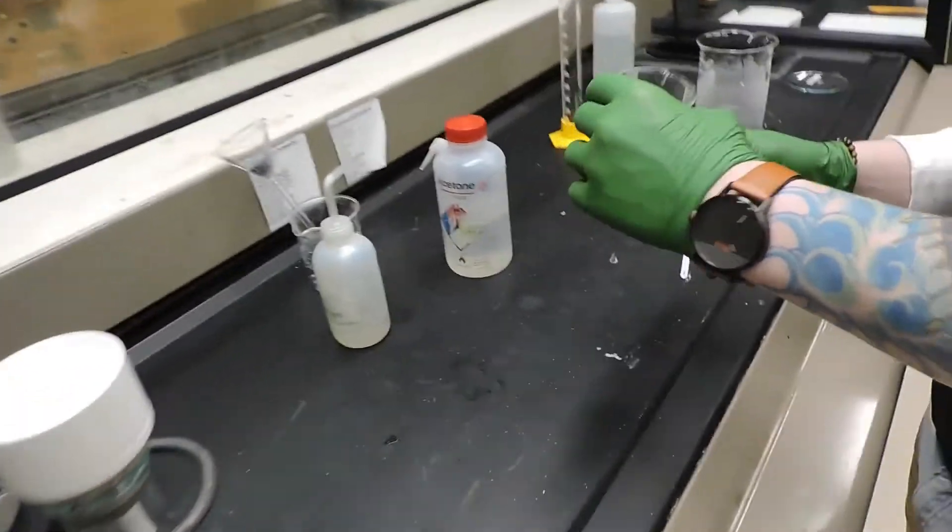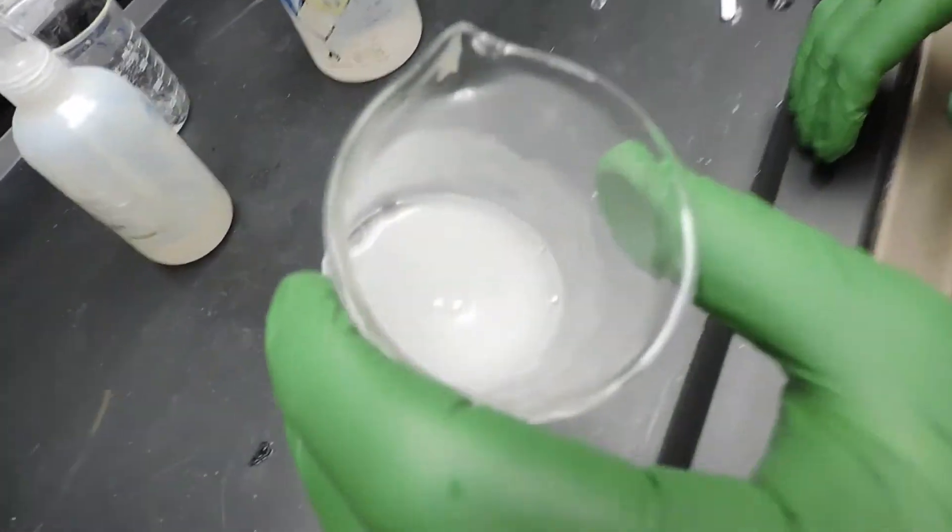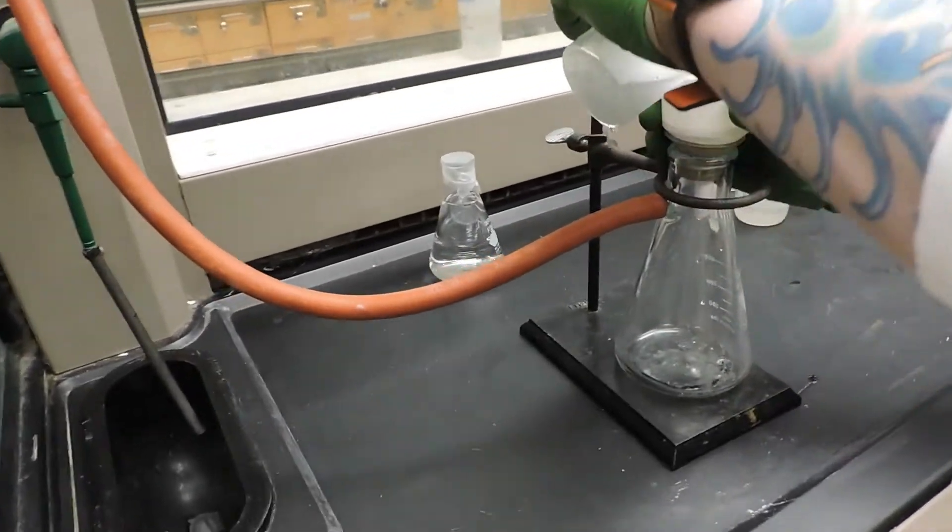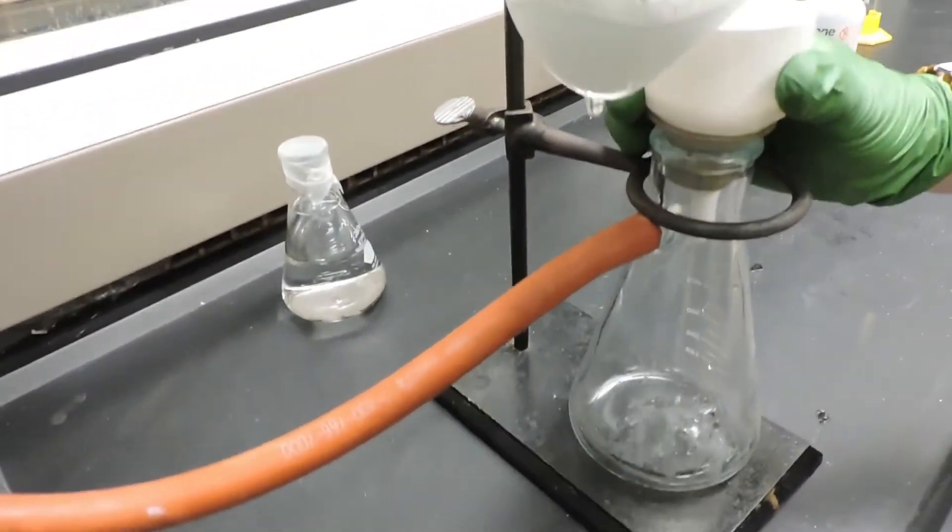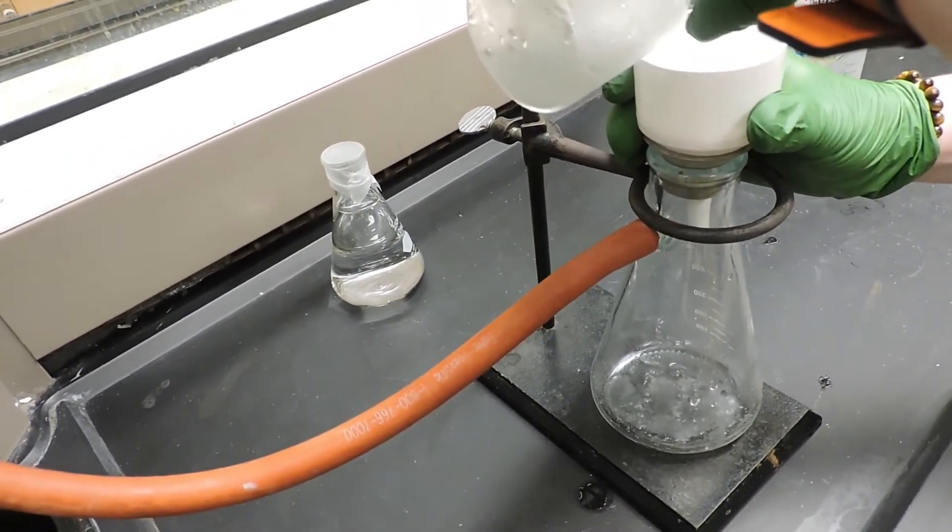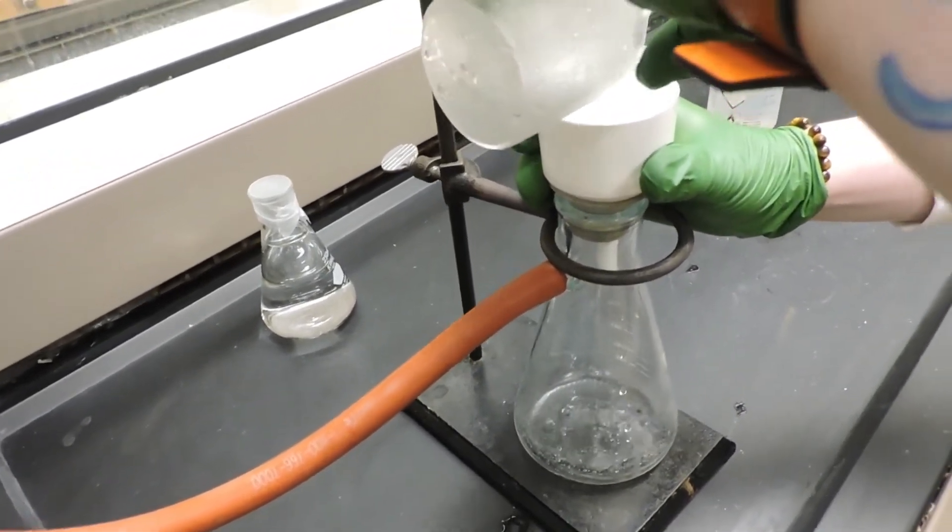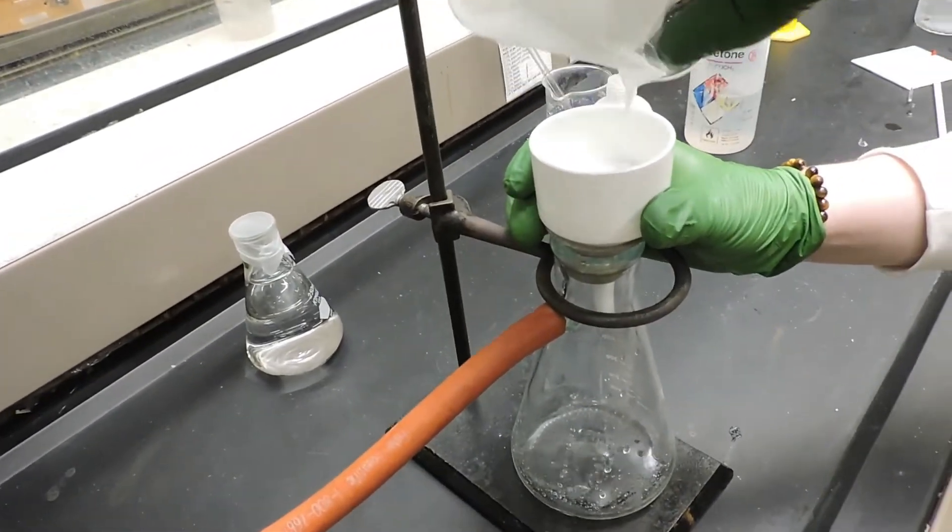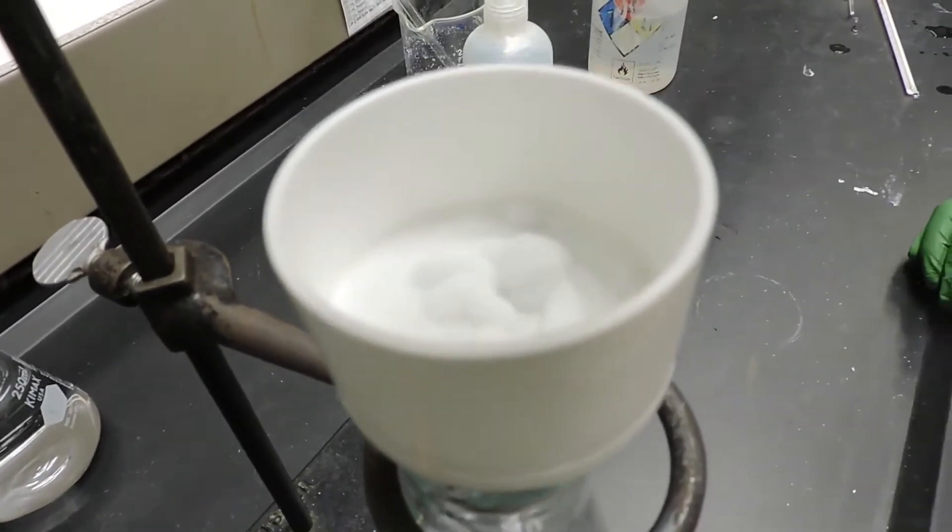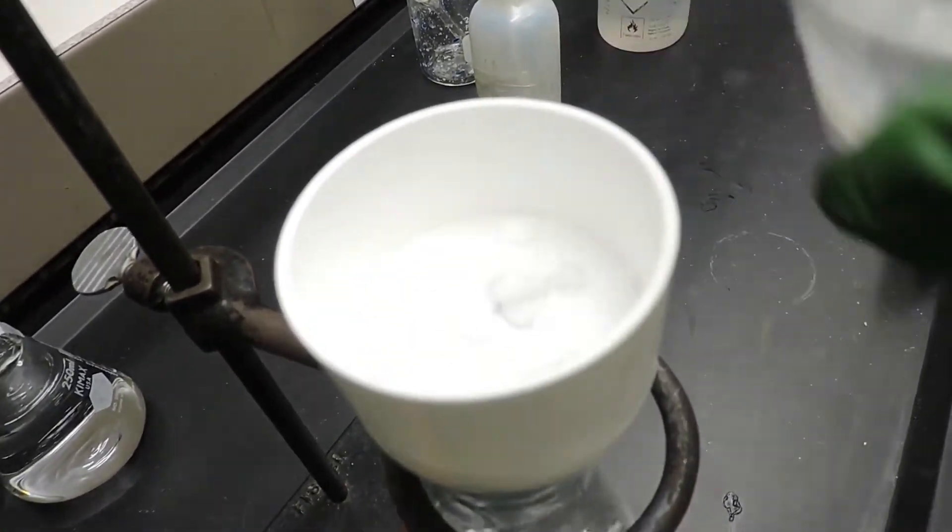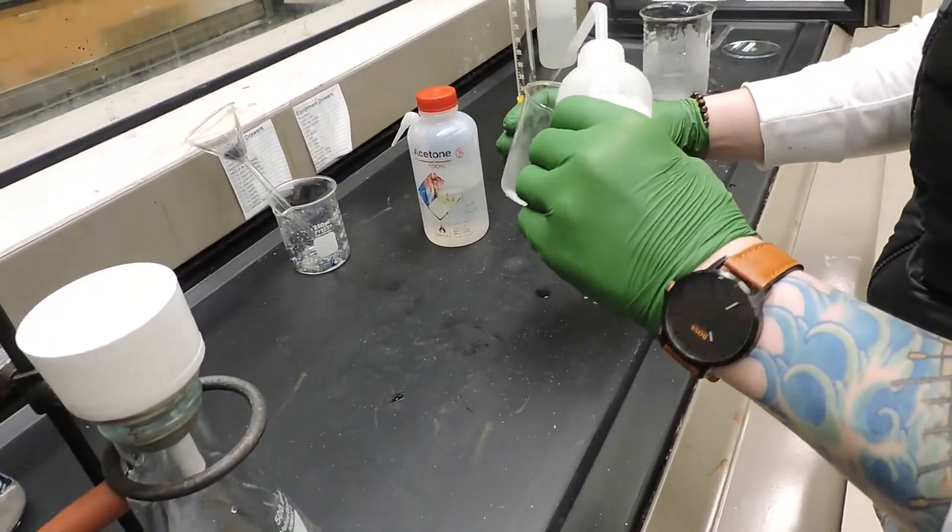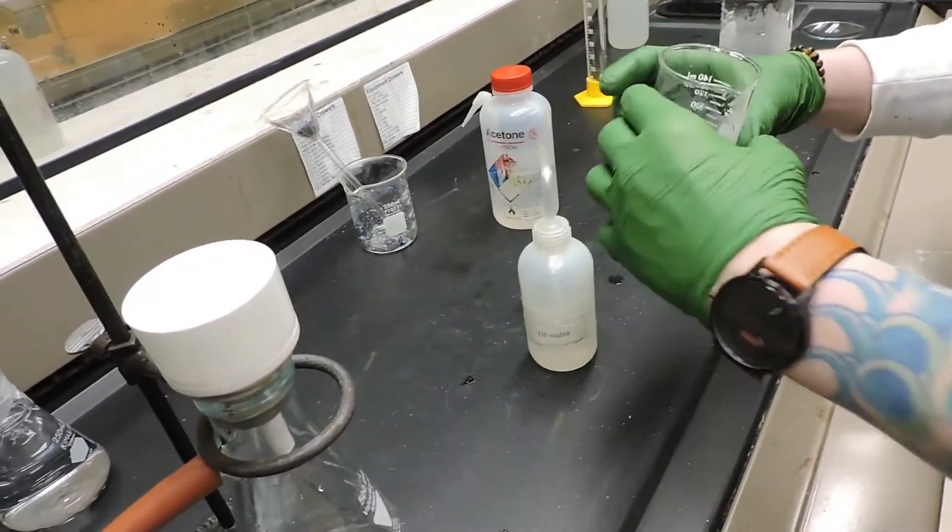Now that we have some crystals in our beaker, you can see, we're going to filter them off using vacuum filtration. And we're going to rinse the beaker with some more DI water to try and get all the crystals that we can.